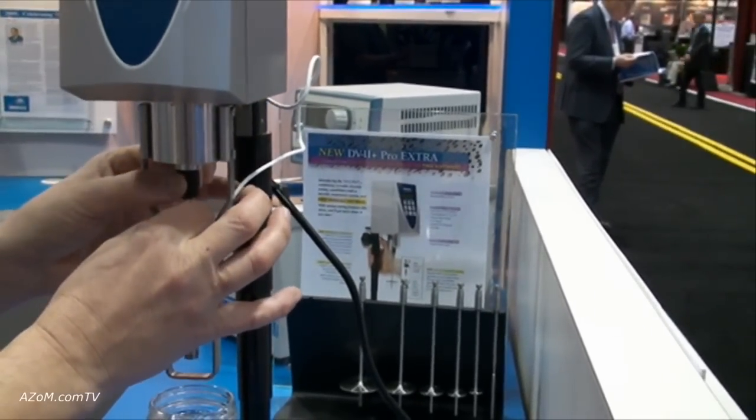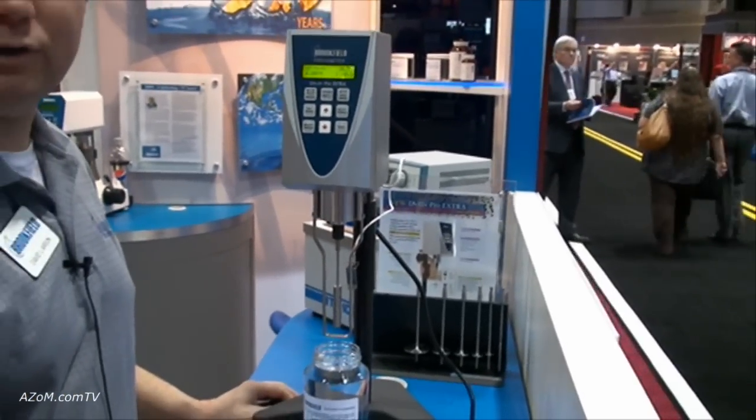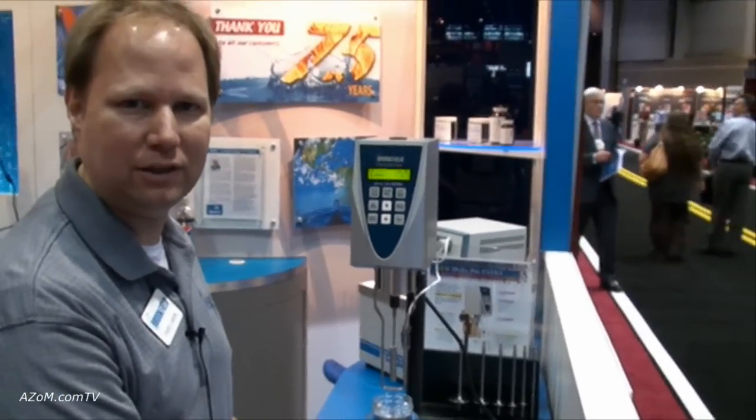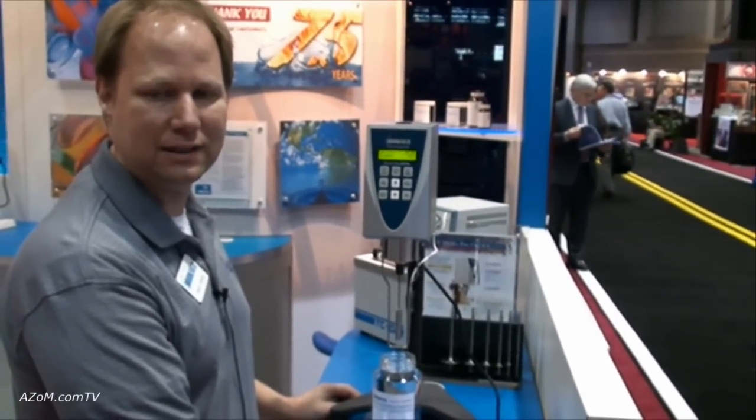I'm just going to quickly take a measurement of viscosity. This unit works on a spring torque basis, so we're measuring the internal friction of the fluid and giving a quick reading of viscosity in centipoise.